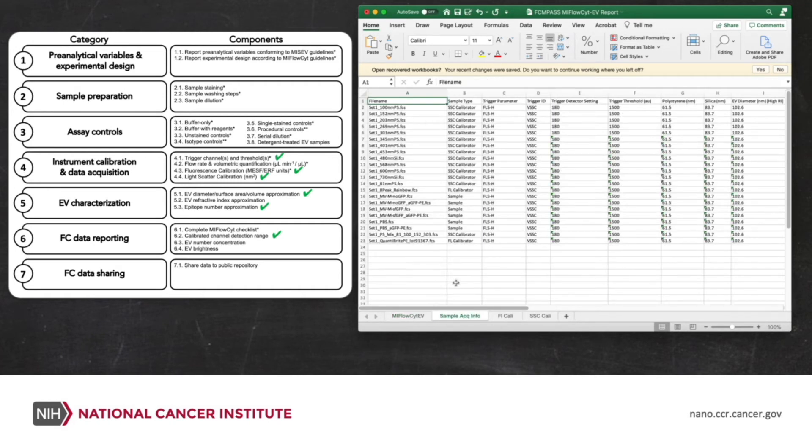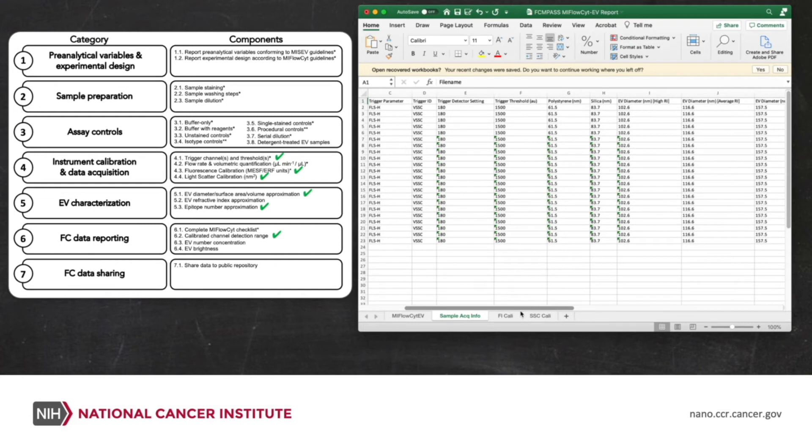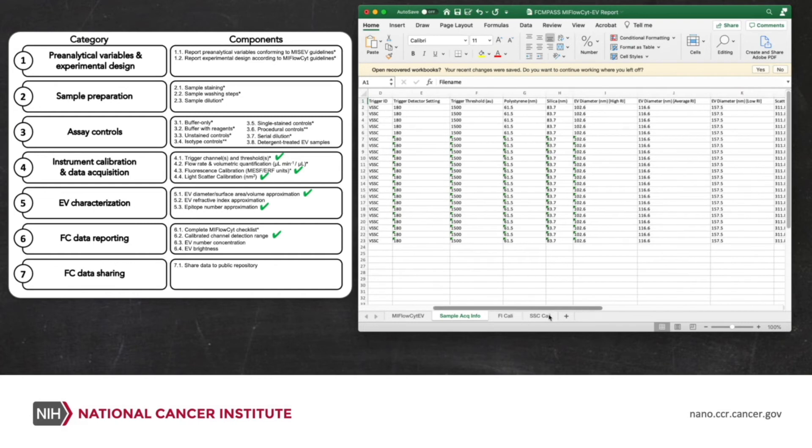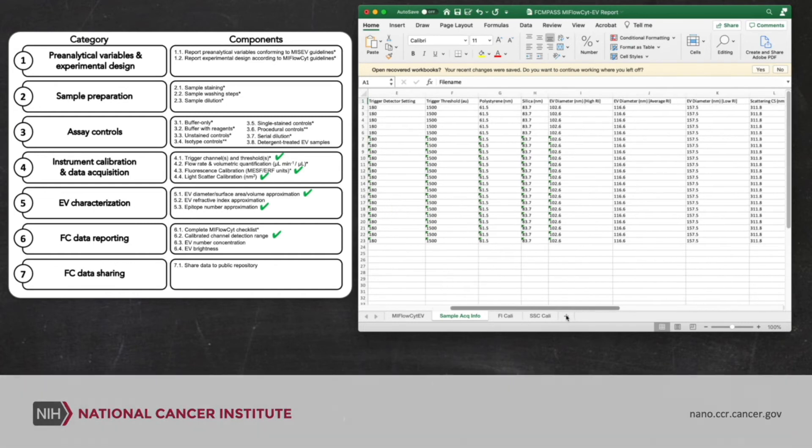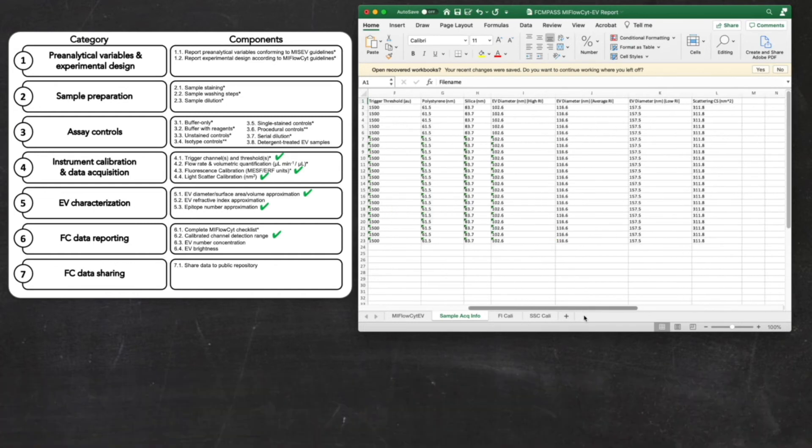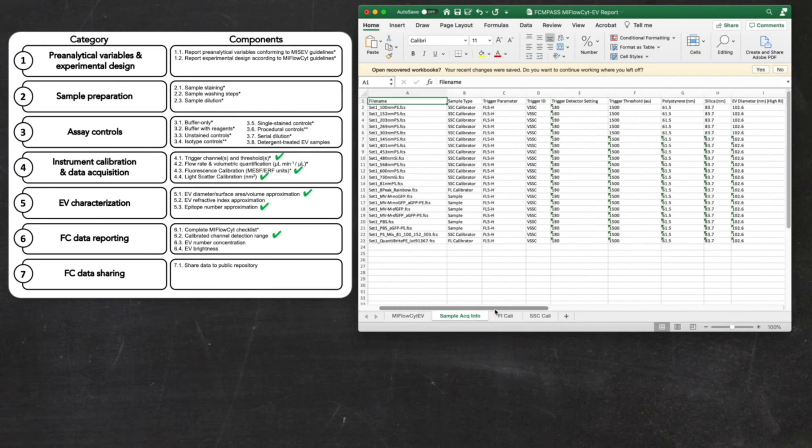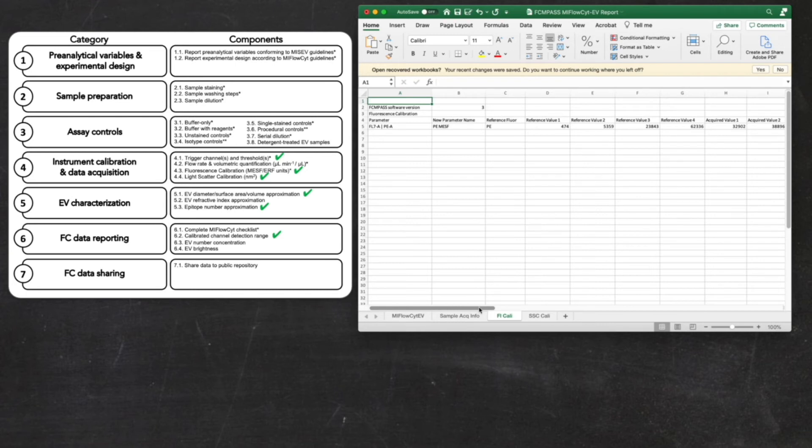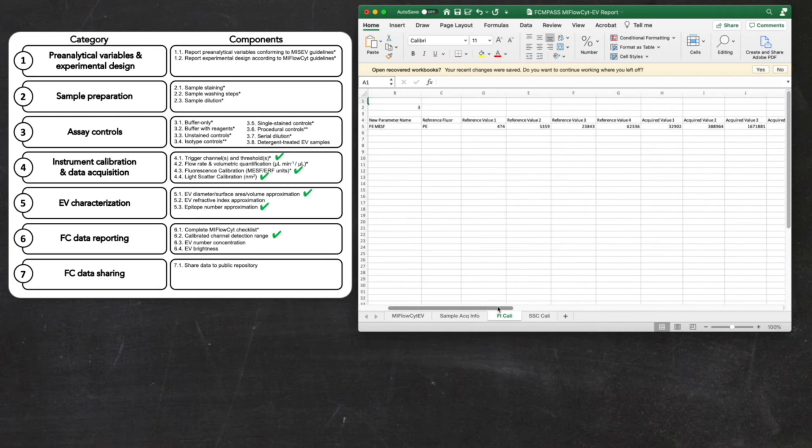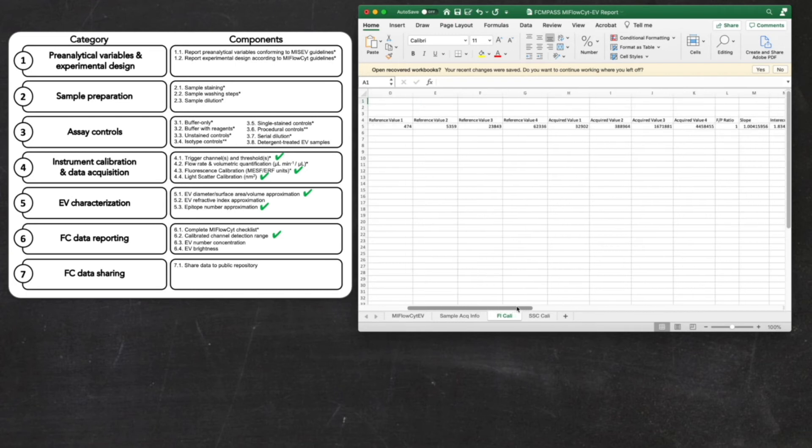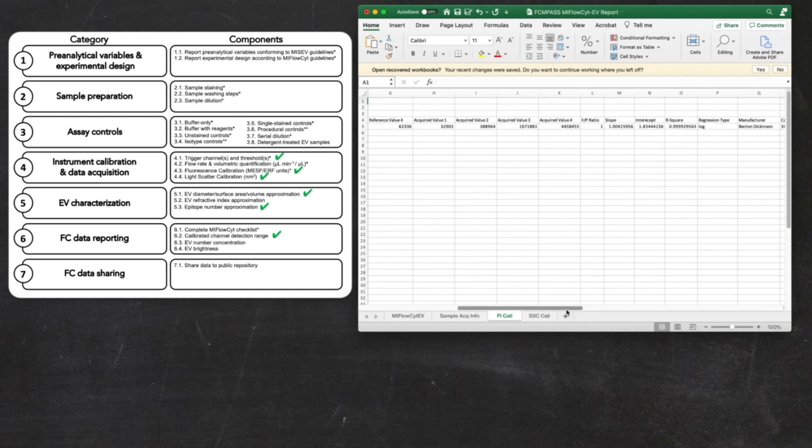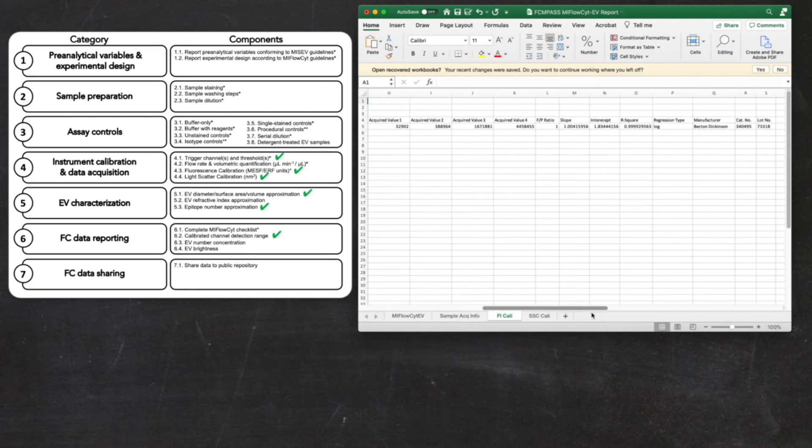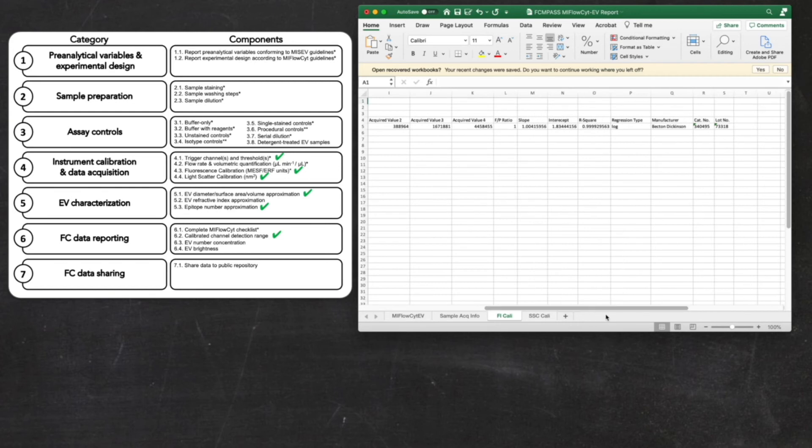This sample acquisition info has all of your limits of detection across all of the different models you've generated. So polystyrene, silica, EVs, murine leukemia virus and scattering cross-section. We know what the threshold was on every channel. The fluorescence calibration, we have all of the metadata, including the acquisition statistics, the reference values, slopes, intercepts, FP ratios, as well as the manufacturer information. And then finally, we have our scatter calibration.